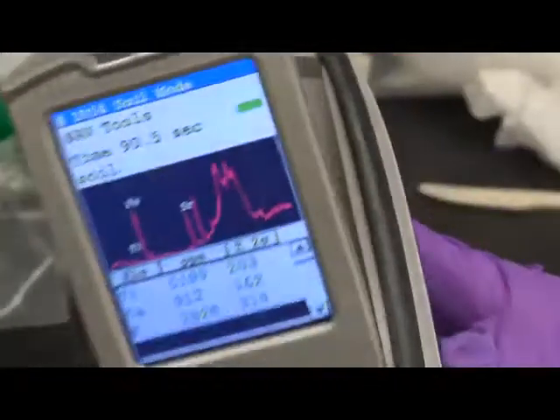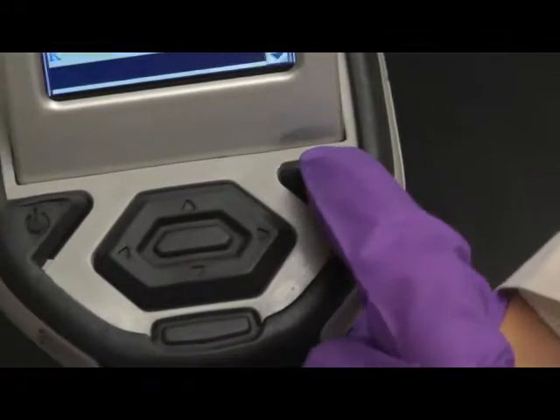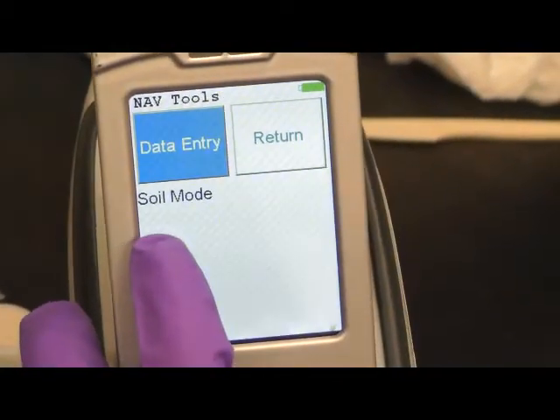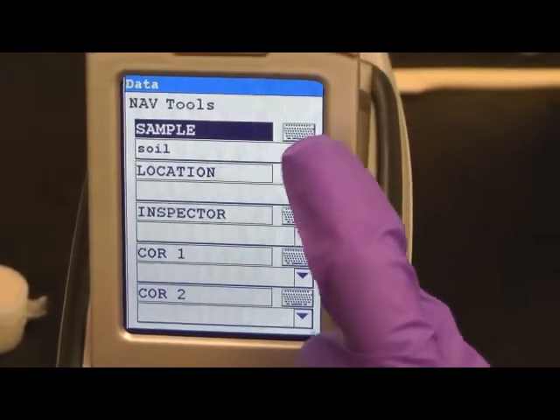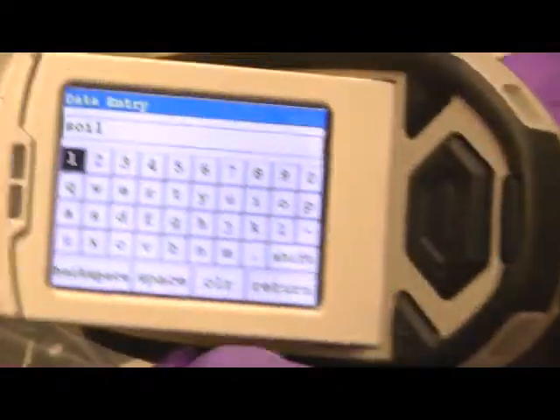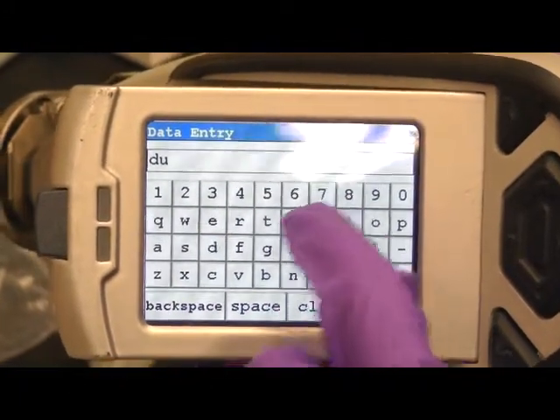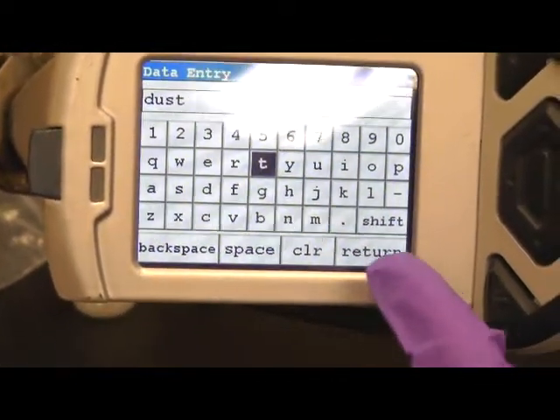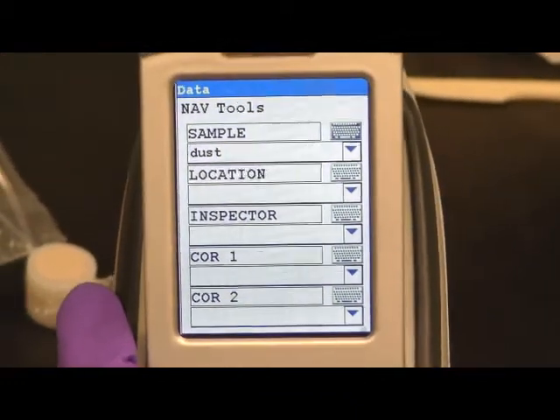Now we are going to measure the second sample, which is the dust sample. Hit the entry button. And then return to the main menu. Here's data entry again. And we click on data entry. And now we are going to change the sample name into dust. Again, we click on keyboard. So we are ready for our second measurement.